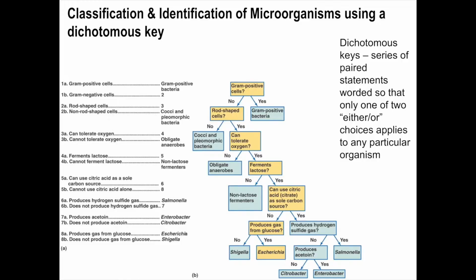So what we're talking about, we have a nice clean order of events here. We're talking about staining bacteria. Okay, we're talking about gram stain as well as capsule, endospore, a variety of stains which allow you to start identifying different types of bacteria. And then if you have phenotypic assays, you can then properly identify them. And so that's what we're kind of looking at here, although microbiologists typically don't do this dichotomous key. I think it's still useful from a teaching and learning perspective to look at this.